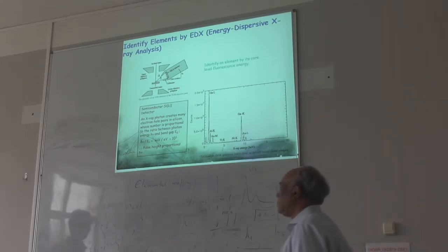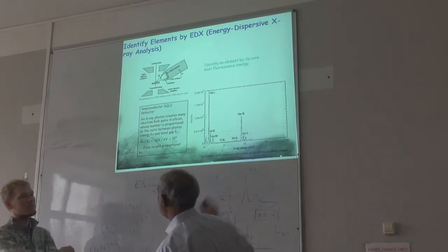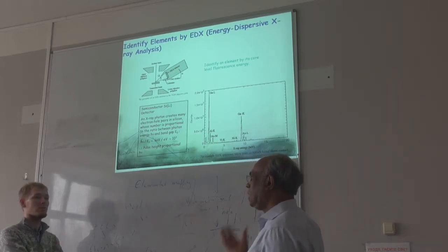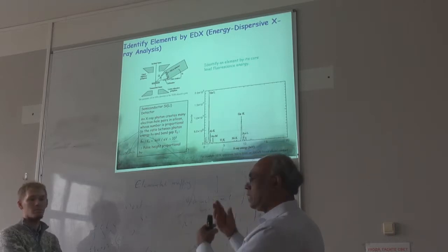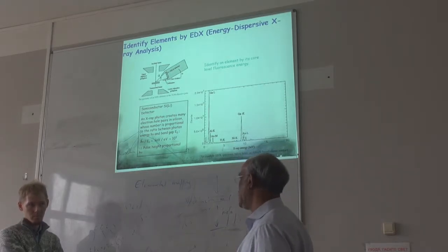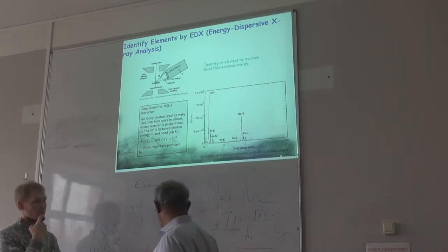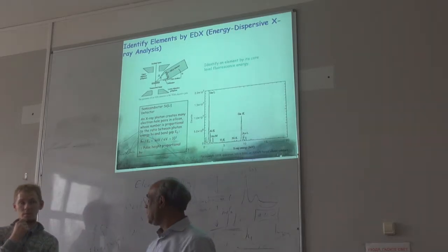Gamini, how does this sensor work? How can we measure? We have an X-ray sensor inside. And how it works? We don't know. Okay, X-ray sensors are more like a scintillator, and then they have some photomultiplier tubes. So that's more like a radiation detector, standard. Then we have something called energy dispersive. Energy dispersion, yes. I don't know if people are familiar with energy dispersive spectroscopy.